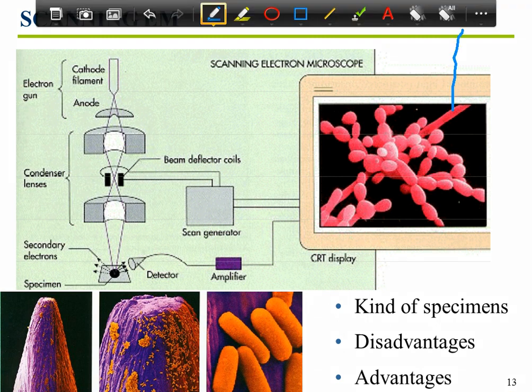Okay, so in this scenario, here is your electron gun up here. You see the magnets. Now look where the specimen is down here. So the electron beam comes through here and it hits your specimen and it knocks electrons off, like dropping a container of water onto an object on the ground. When the water hits that object, the water molecules spray off in different directions, and these electron sprays are captured by the detector to give you an image.